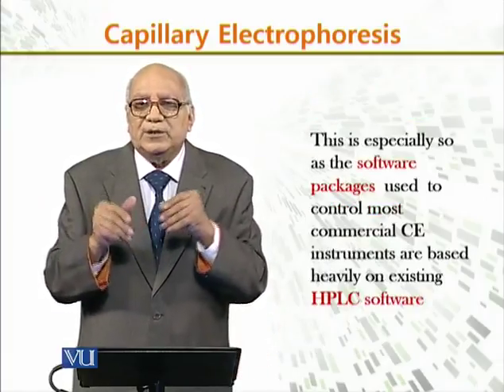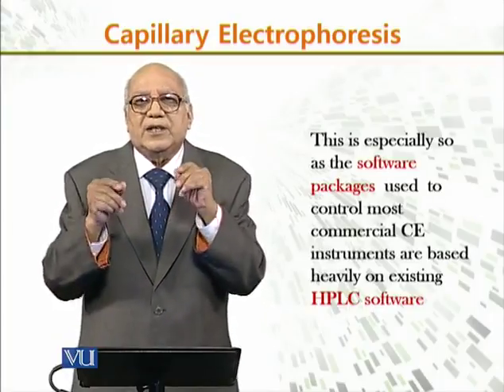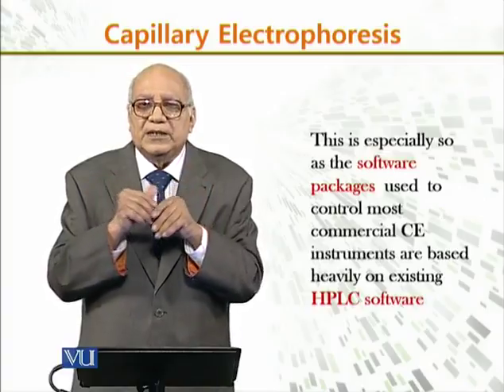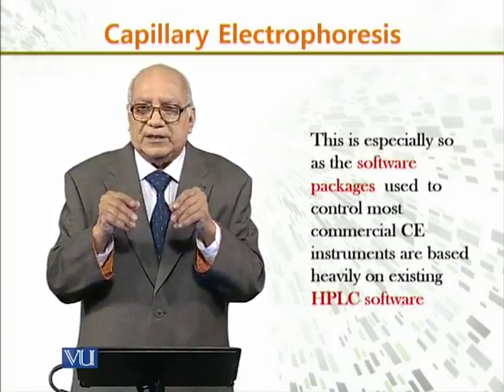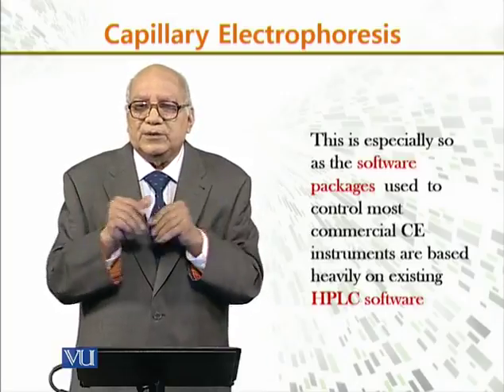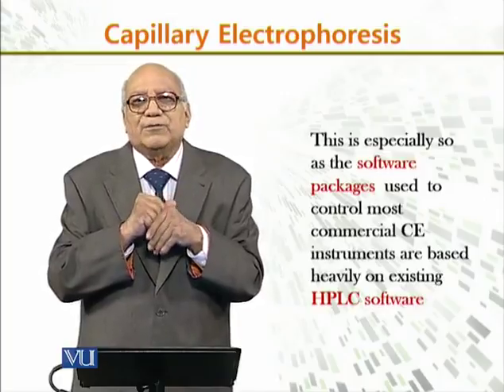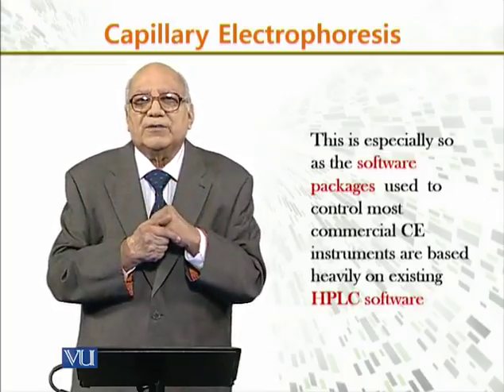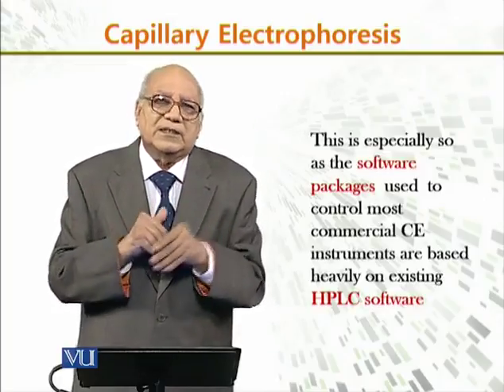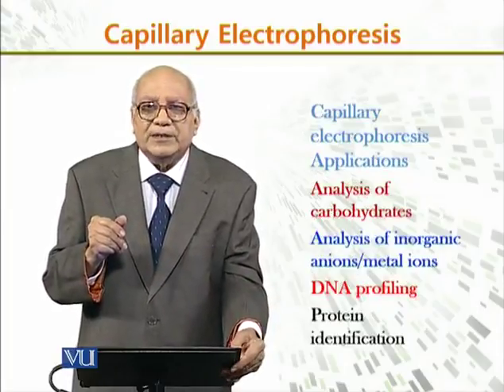This is especially so as the software packages which control most commercial capillary electrophoresis instruments are based heavily on existing HPLC software. So the software of both instruments is somewhat compatible. They work on the same principle.